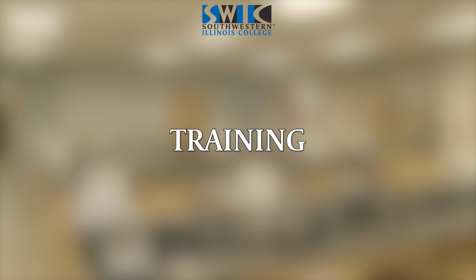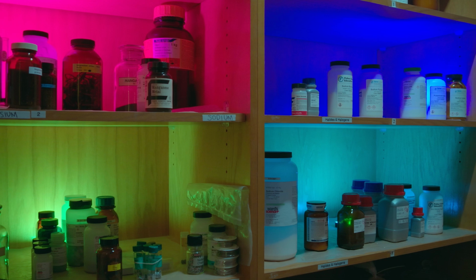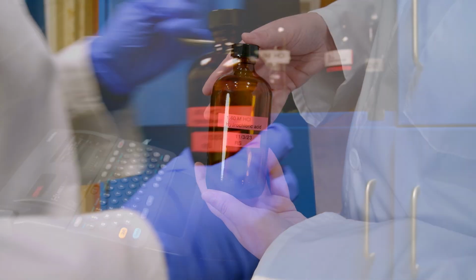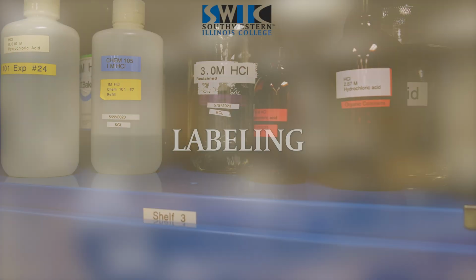Finally, ensure that everyone in the lab is trained in the specific chemical storage guidelines and understands the safety procedures. Proper chemical storage is the cornerstone of lab safety. When you organize, label, and store your chemicals correctly, you're creating a safer work environment for yourself and your colleagues.